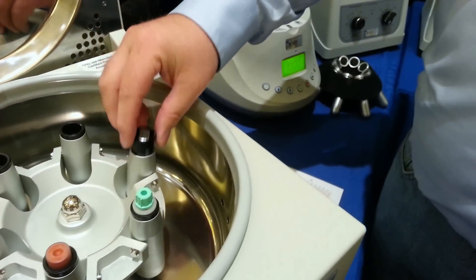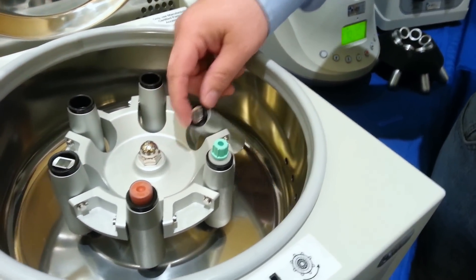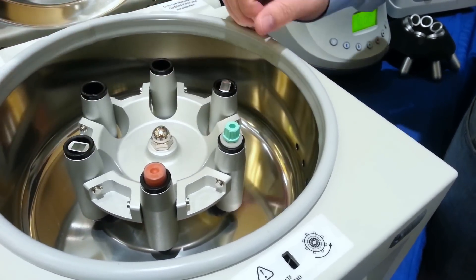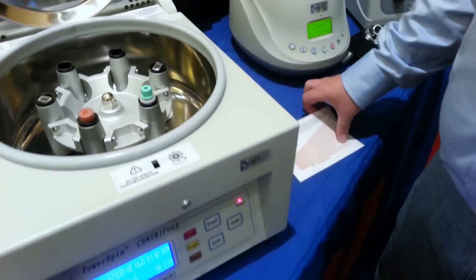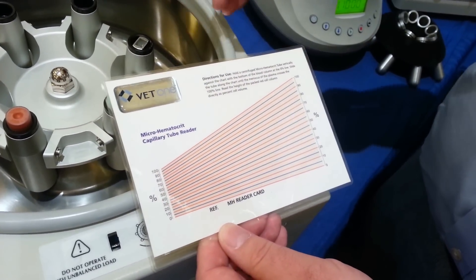You can spin up to four per adapter, and they will spin out horizontally and give you that flat separation that you want. Does that come with the unit, or is that a separate accessory? These adapters are a separate accessory. But they will come with a hematocrit reader card, which we have a VET-1 label on.